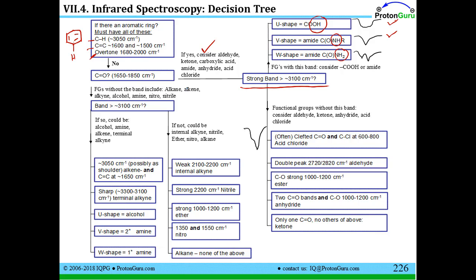More of a V shape is generally an NH group, and this distinctive W shape, which is two V's, corresponds to two NH stretches instead of one, that is an NH2 group. The reason for this broadening of the peaks, these are all kind of broad compared to the sharp peak you expect for, say, a CO double bond, comes from the fact that you have hydrogen bonding. We talk about this in the primer, and you can do your reading there.